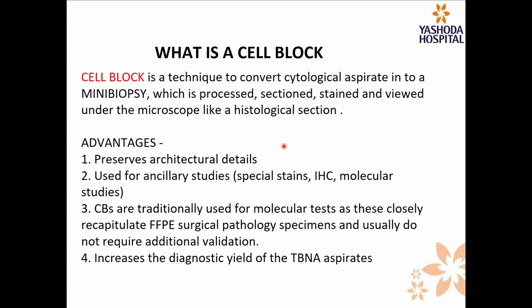Now, what is a cell block? It is actually nothing but converting a cytologic material or an aspirate into a mini biopsy, and that mini biopsy is now utilized as a biopsy sample, and it is processed, sectioned, stained, and studied under the microscope as we study the biopsy sample.